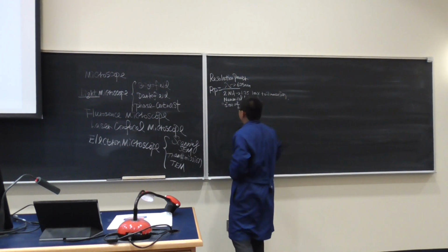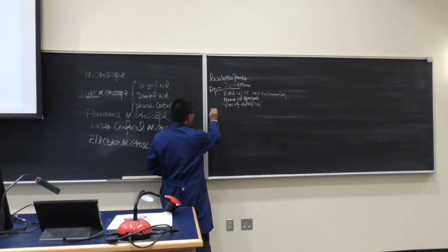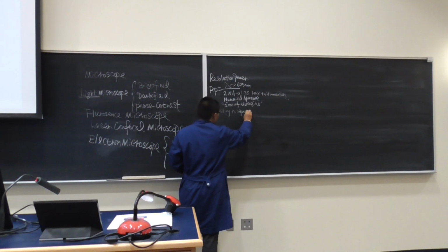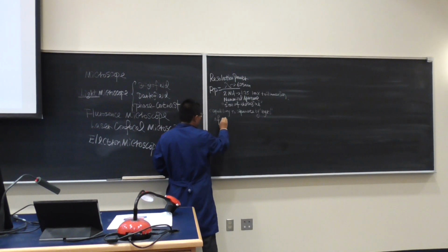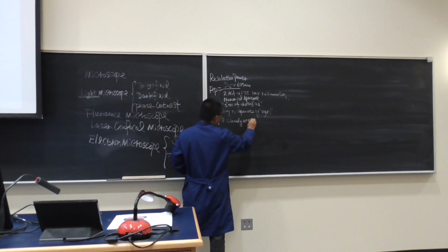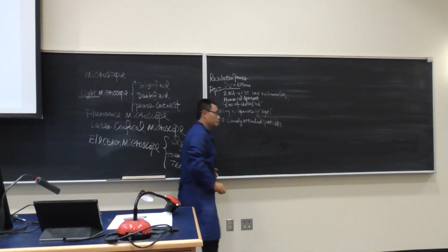So when you see this formula, we will understand what resolution power is. This is the capability to separate, by eye, 2 closely attached particles, which means how clear you can see it.